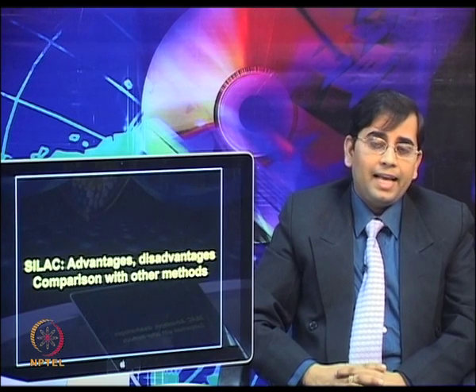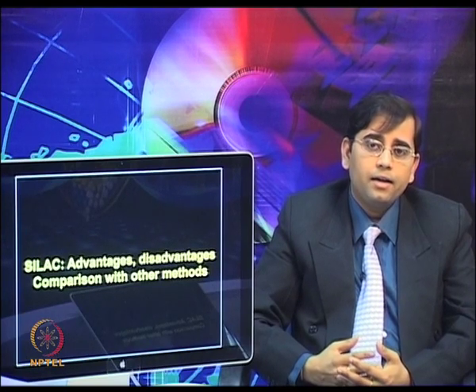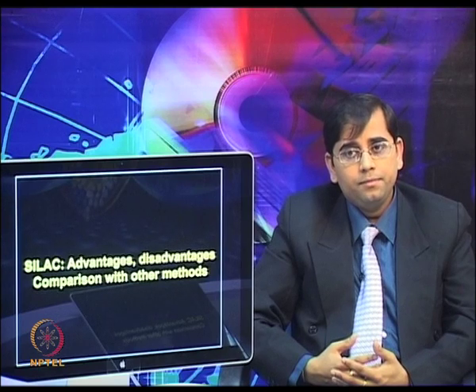So, after discussing the SILAC technique and watching this animation of this entire process, now let us discuss the advantages and disadvantages of SILAC method and compare it with some other tagging methods. So, as we have discussed and realized, SILAC method is very simple and robust, and it labels the entire proteome without chemical derivatization and with fewer sample handling steps.